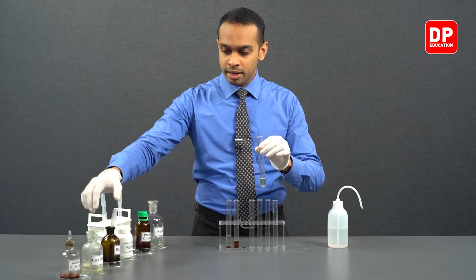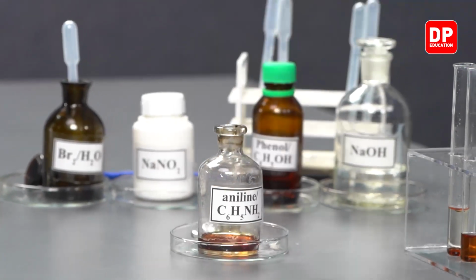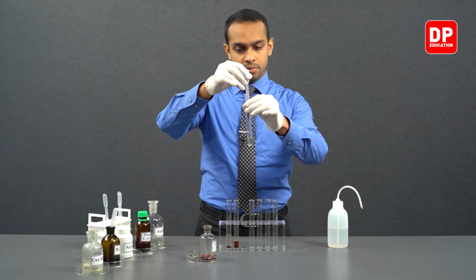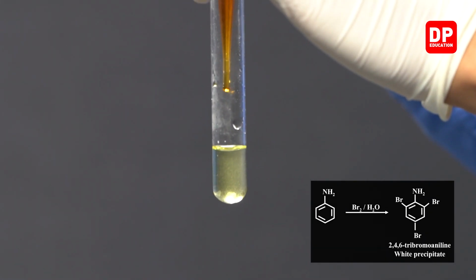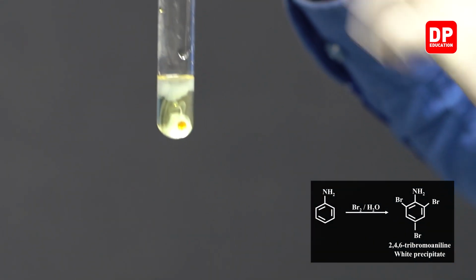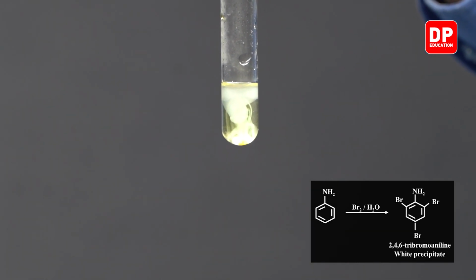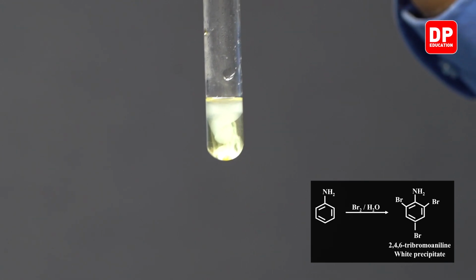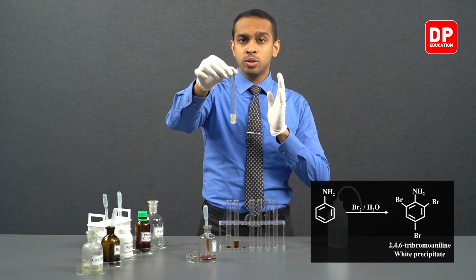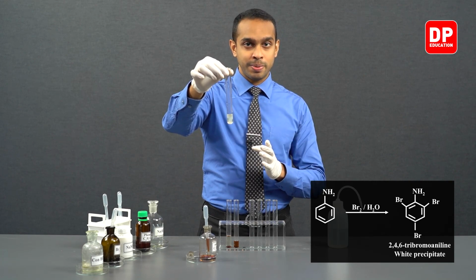Now, let's take aniline and add a few drops of aniline into this bromine water solution. As you can see, upon addition of just a single drop of aniline, we can very clearly see the formation of a white precipitate. When bromine reacts with aniline, it forms 2,4,6-tribromoaniline, which is a white precipitate.